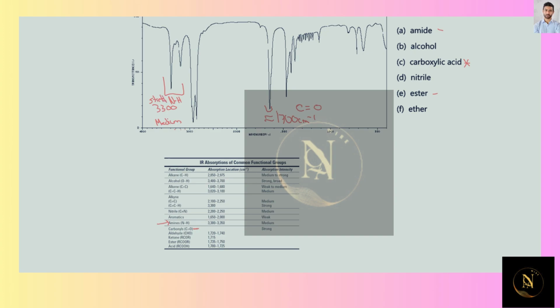If we were to have, for example, an ester, we wouldn't have these kind of signals, right? We also have these carbon-nitrogen stretches, which are more common. And since we have a carbonyl group and we have an amine attached to it, all of these signals are going to be consistent with an amide.